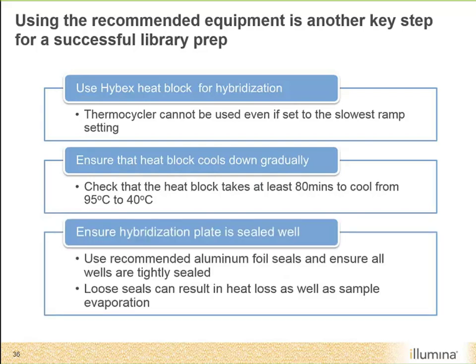And because that can be a lengthy amount of time for samples to be incubating, we want to make sure that the plate is well sealed. We want to avoid any type of evaporation. So we want to make sure that the recommended aluminum foil seals are used and ensure that those are tight. You cannot have seals that are too tight. So always make sure that we have a tight seal on those aluminum foil. Any loose seals, as you can envision, can lead to evaporation, and that can definitely impact library prep.